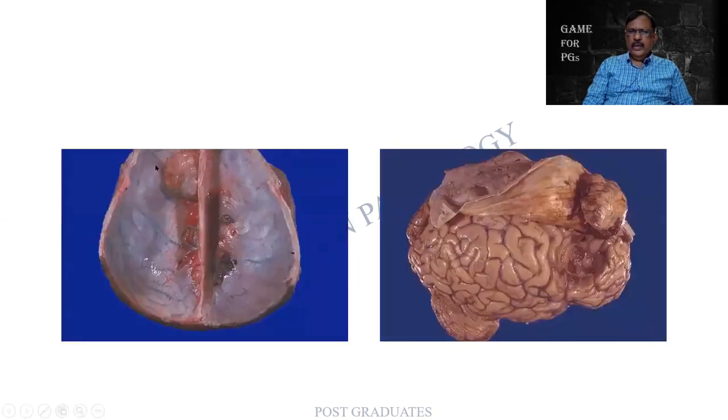This we had seen earlier also. You find that the brain parenchyma is unaffected, but the tumor is clearly arising from the meninges. So, what are all the lesions that we have seen so far? We had seen the meningitis, the areas of hemorrhages, vascular abnormalities, or areas of infarction, and then the tumor.